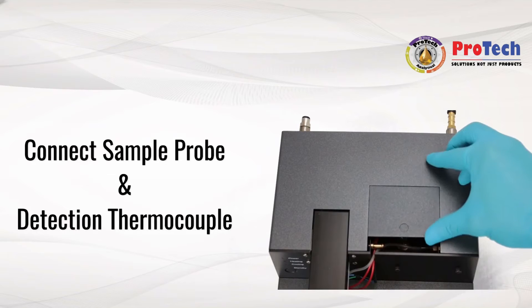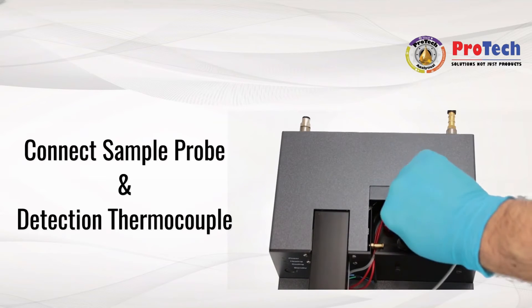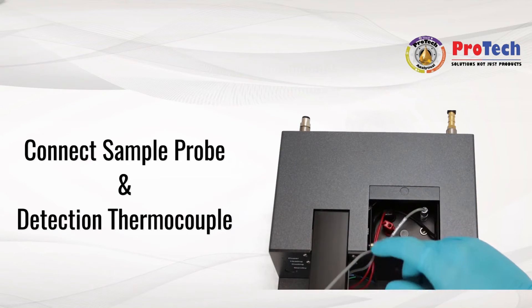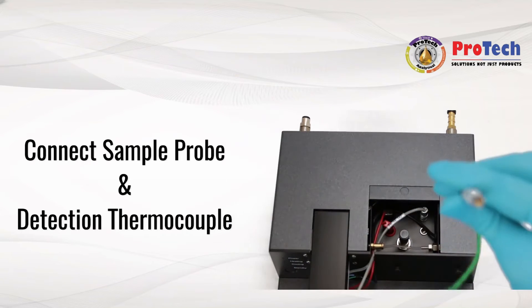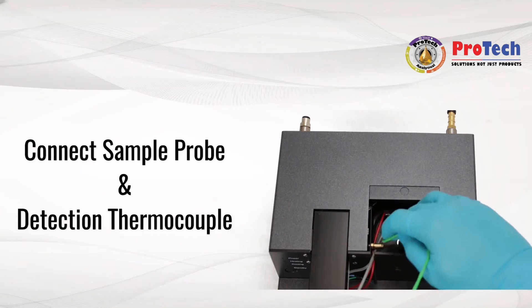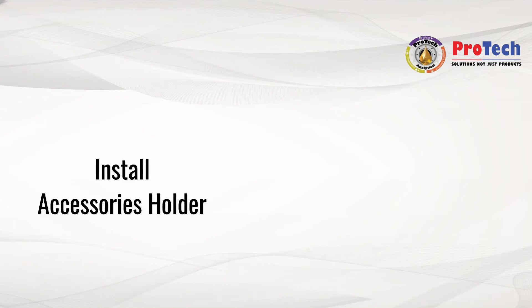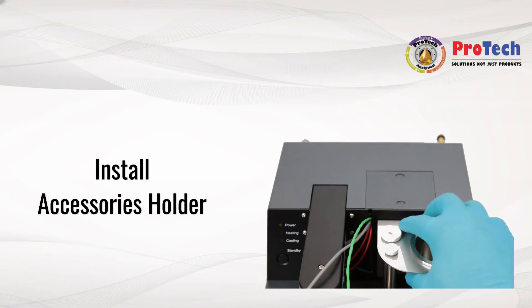Slide the top panel in order to access the connection area. Plug the sample probe and pass the cable through the opening. Process in the same way with the detection thermocouple, then place the sample probe and detection thermocouple in the holding place on the accessories holder.